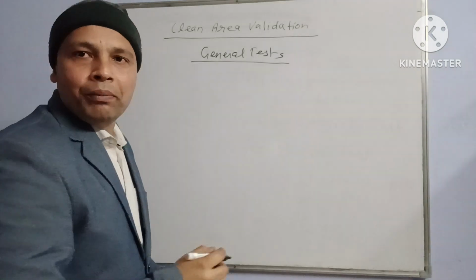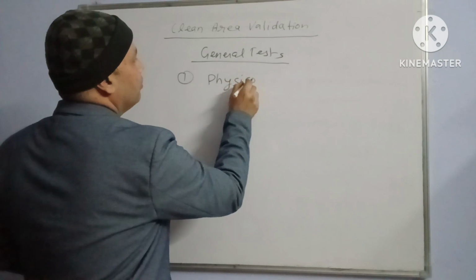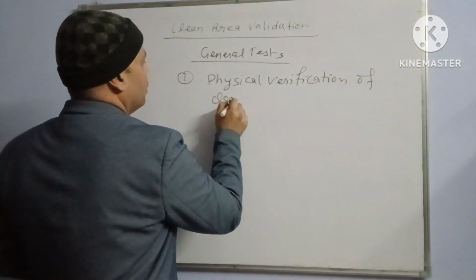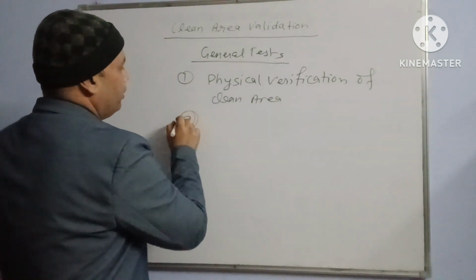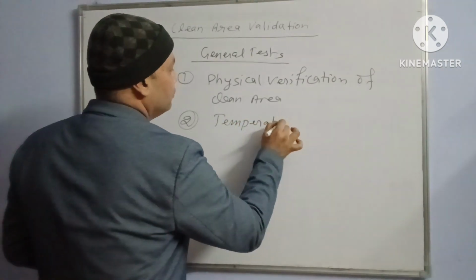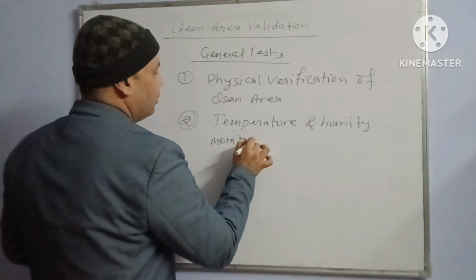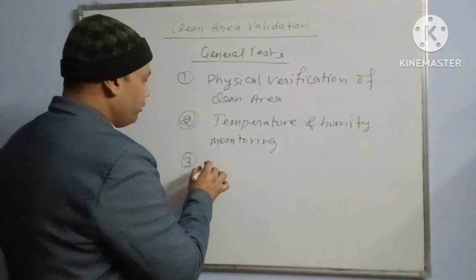Some general tests that we are performing, just like physical verification of the clean area, then temperature and humidity monitoring, right? Then third is the pressure differential monitoring of the clean area.